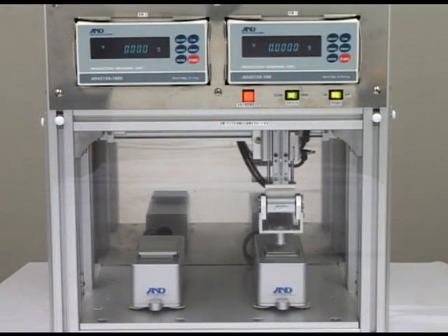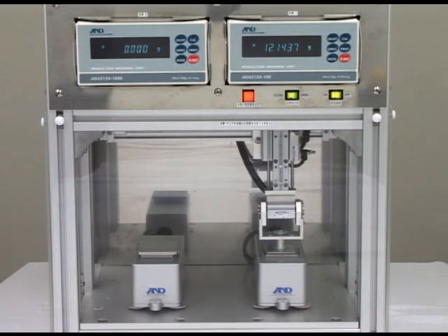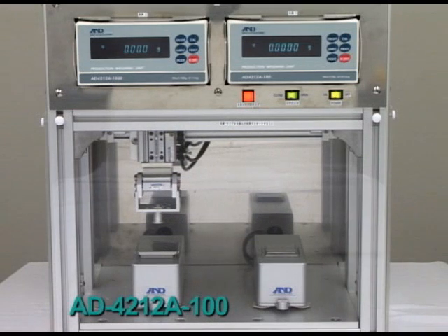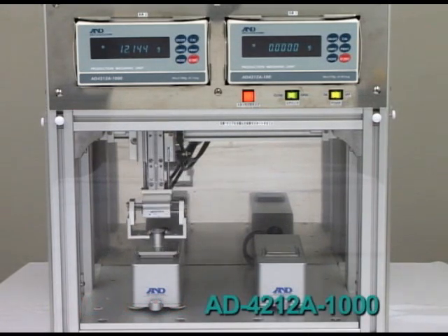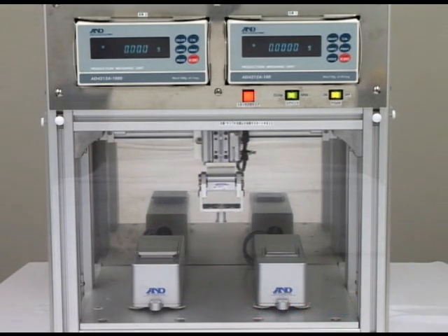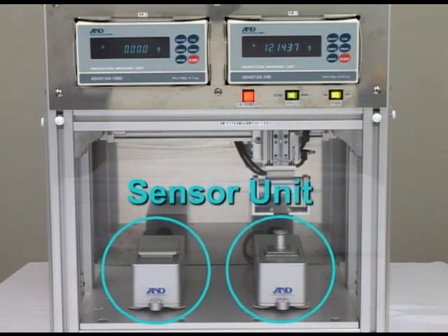This video shows a demonstration of the AD4212A series. The unit on the left hand side is the AD4212A100 and the unit on the right hand side is the AD4212A1000. The AD4212A series consists of a weighing sensor unit and a display unit.